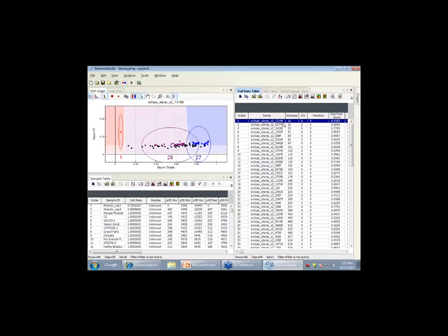These are predefined SNPs, exactly. So this is the Illumina genotyping. It's a true genotyping platform. It's not a sequencing platform. So these are SNPs that are predefined. You've designed an Illumina assay on them, and we're not going to talk about how that's done. But in SolCAP, we worked with Robin, who designed SNPs based on the alignments that she was talking about, and some other data that we generated. And we send the sequences to Illumina, and they design an assay around it, basically a set of primers. They design the physical oligos for those primers.